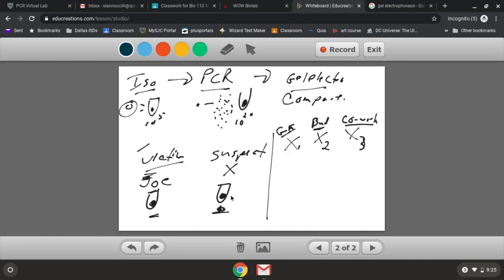And we suspect that this DNA belongs to one of these people. Now, it might not belong to any of these three people, but let's just assume it does. So what we can do is take the DNA found at the crime scene and compare it to the DNA of these people. How do we do that? We have to go through these processes.